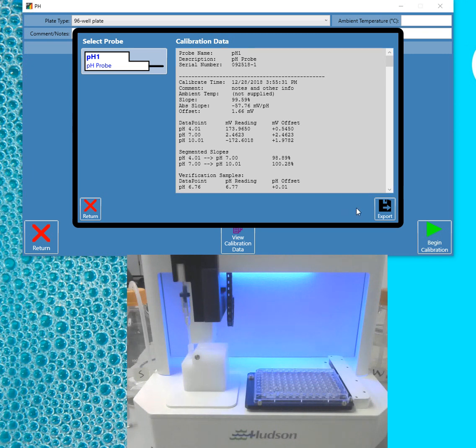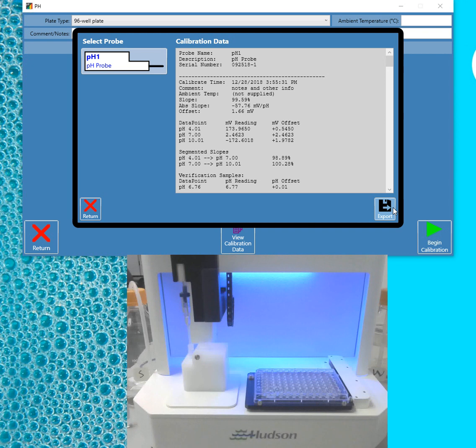You can also export this information. So if you're currently using a manual log, you may want to just export the log file.